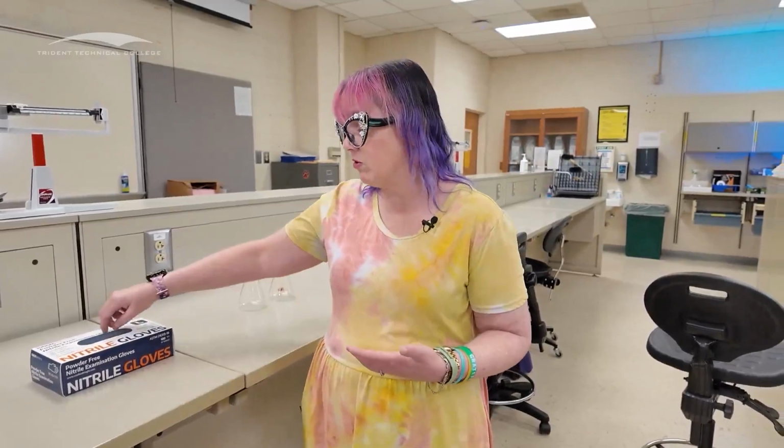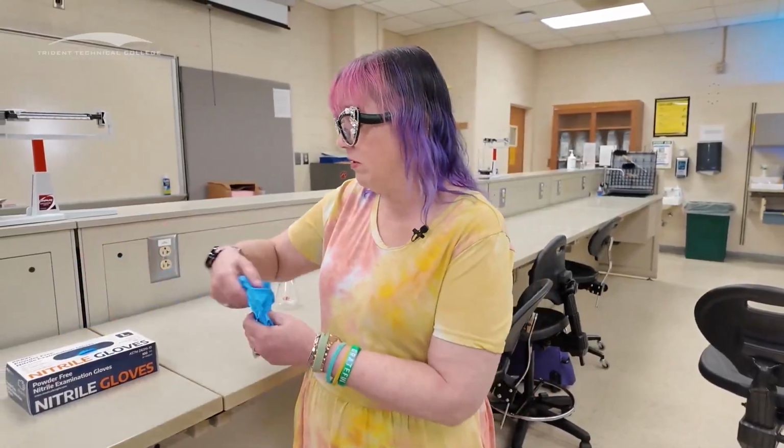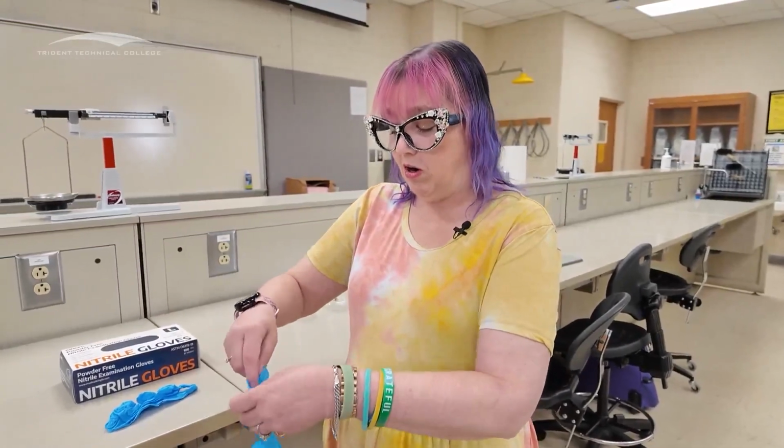For these, it's necessary. So I want to show you how to properly put on a pair of gloves, how to take them off, and then talk about the proper protocols for using those gloves in those experiments. So let's talk about how we put those gloves on. We're going to take gloves out of this container. Here's one, here's two. I'm going to set those down. We're going to make sure that we put them on appropriately.